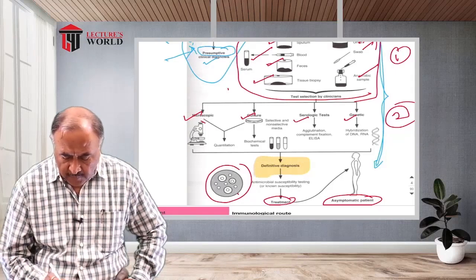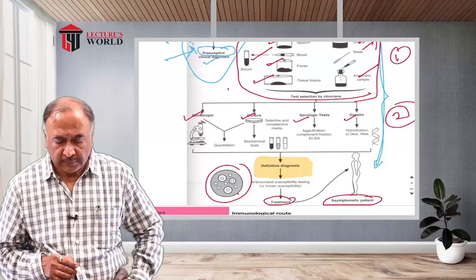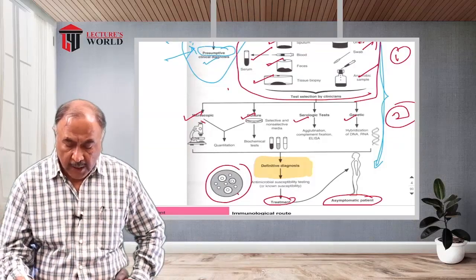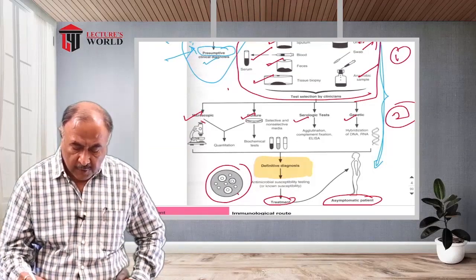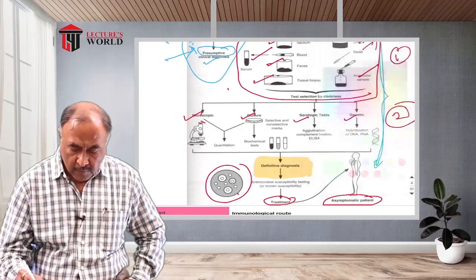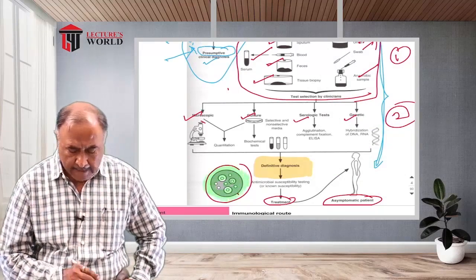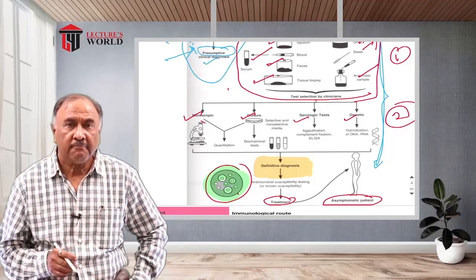This is followed by this process, that is sensitivity testing.